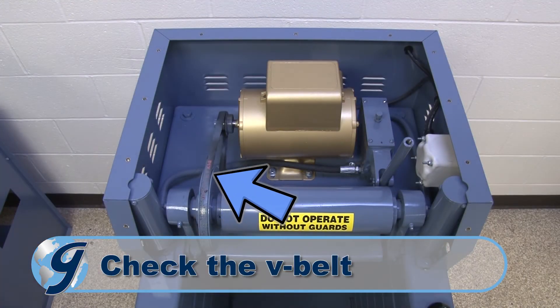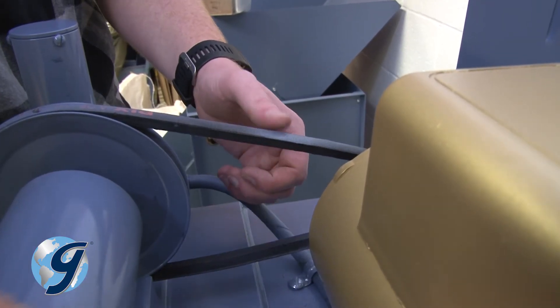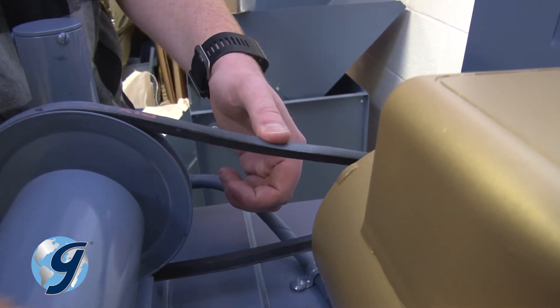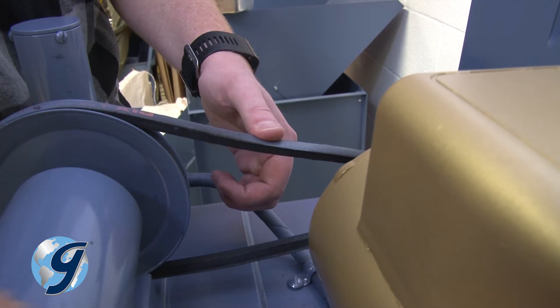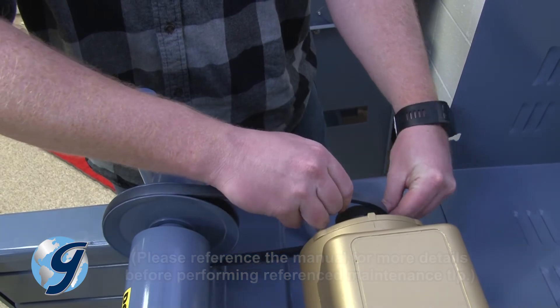Check the V-belt periodically for wear, tension, and alignment. It should neither be too tight nor too loose and should deflect about a quarter inch. Worn or frayed belts should be replaced immediately.